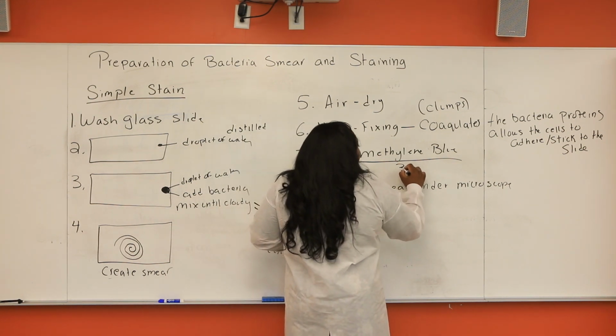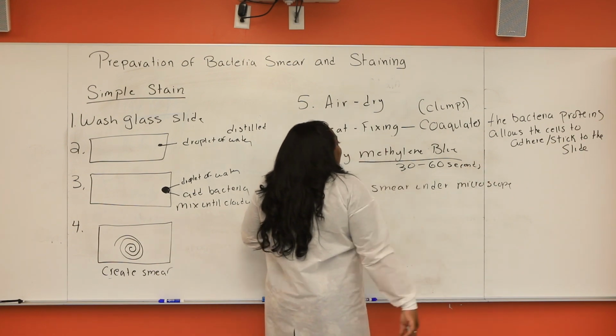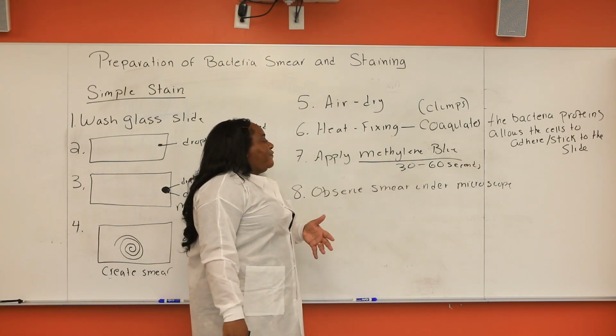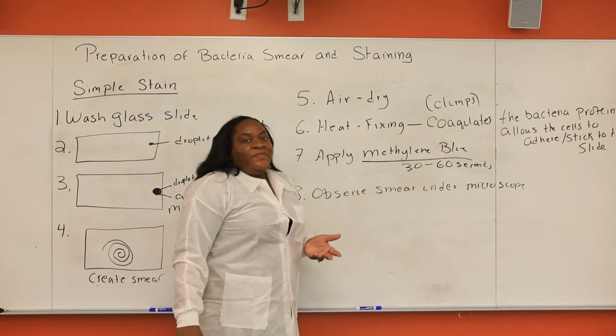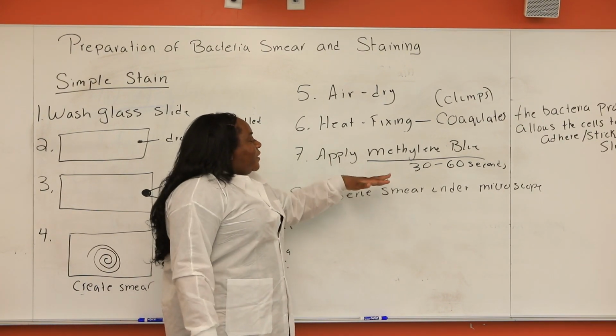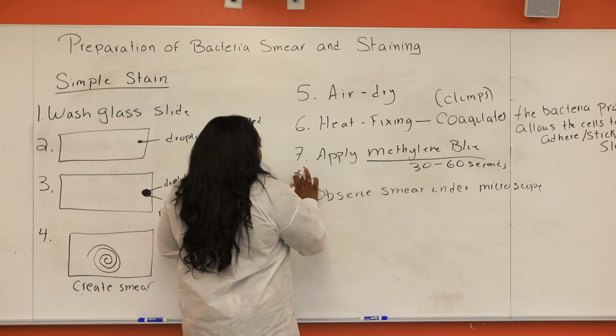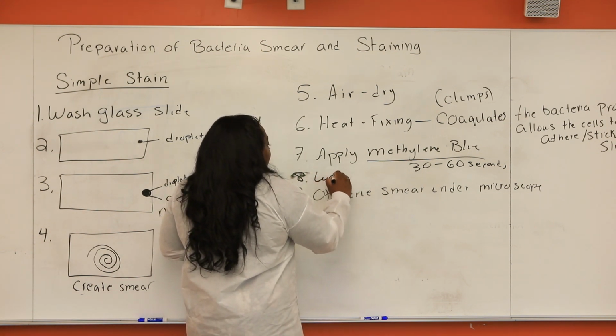And usually you can leave it on for 30 to 60 seconds. The good thing is that it's not so time sensitive, so if you leave it on longer, it's not going to do anything to hurt the bacterial cells. Okay? So after, let's say 60 seconds, then, I should have put this here, you're going to wash the slide.